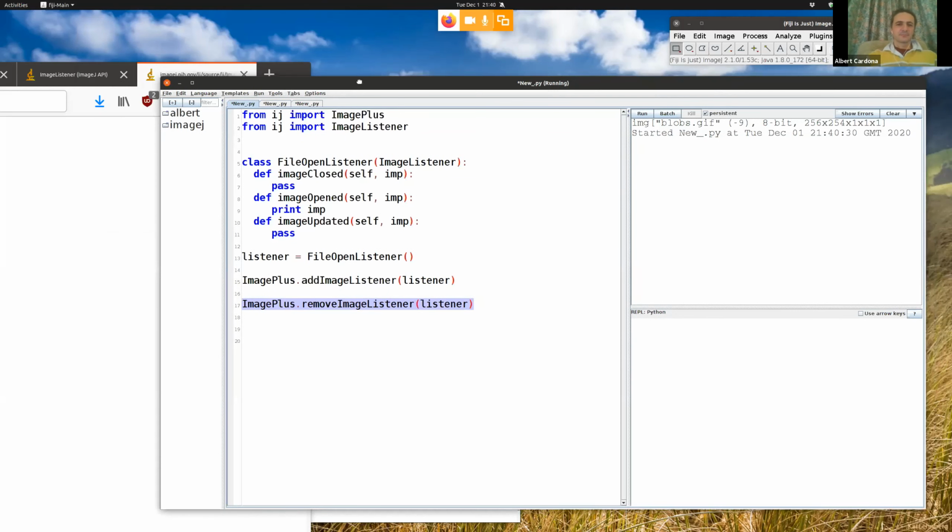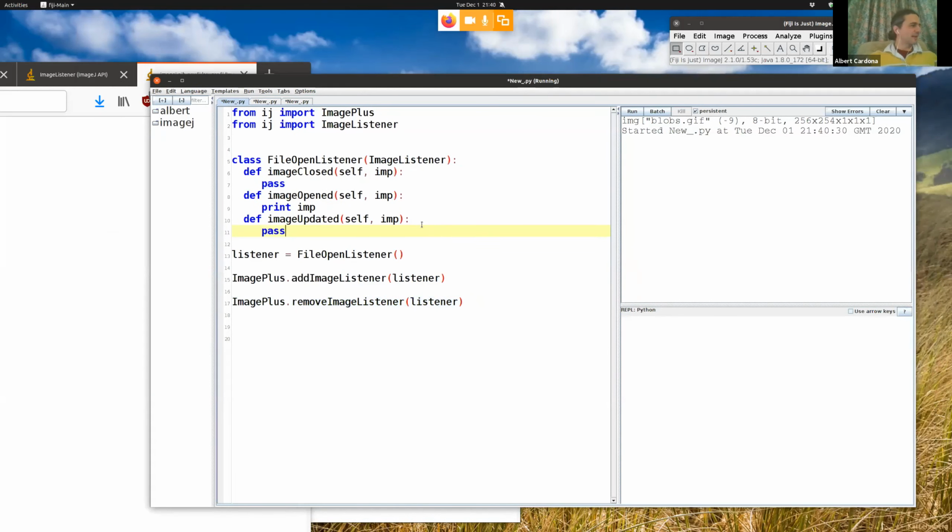Right. So now I think I answered your question 10 times over, but that's good. That's why we are here.